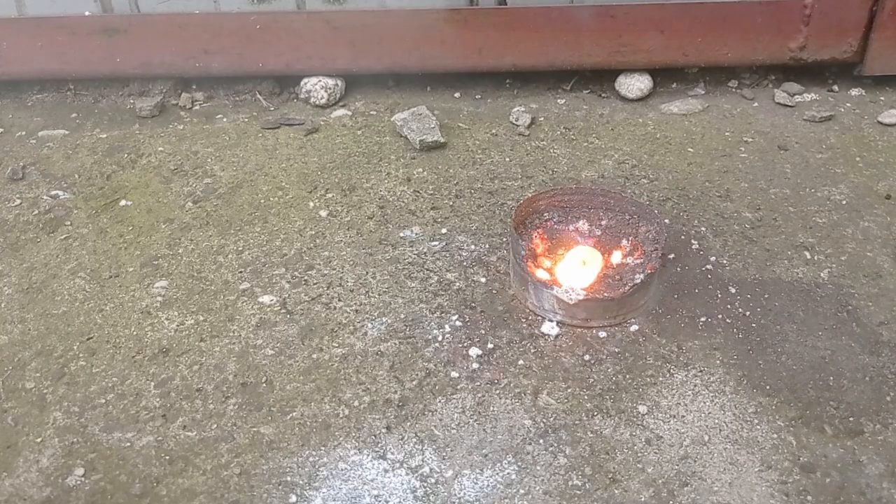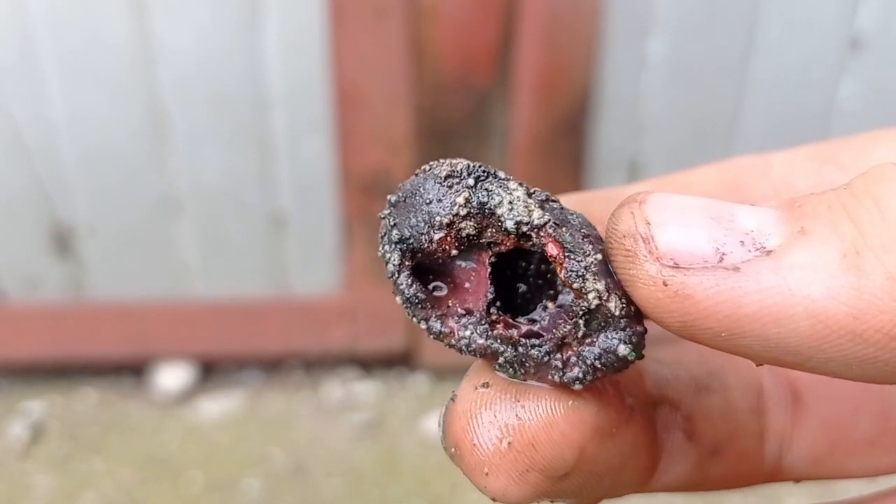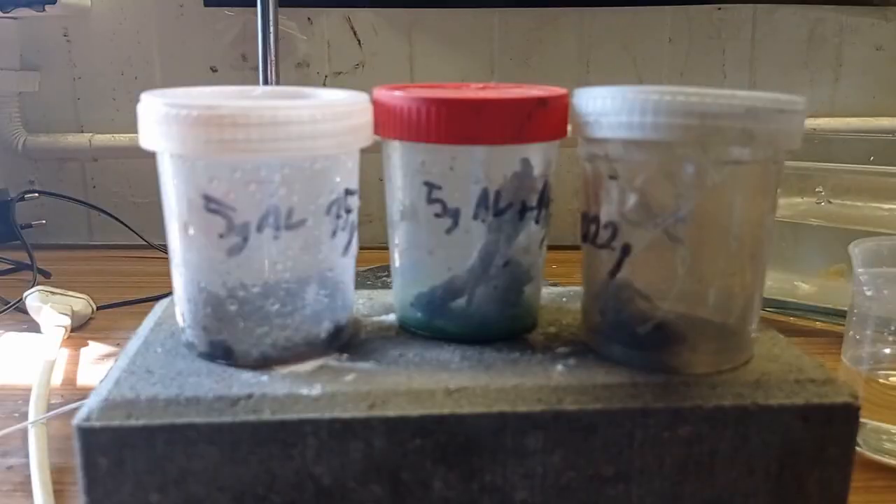I'm unimpressed — the previous thermites were lame. It even melted my steel can. Perfect, that's okay.